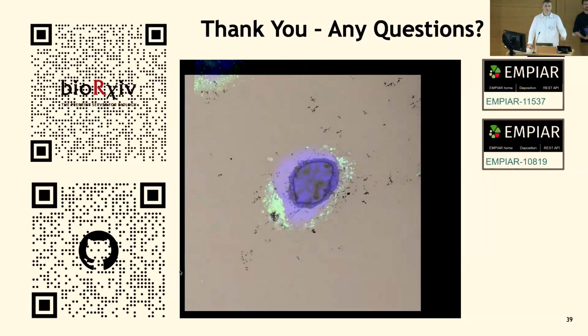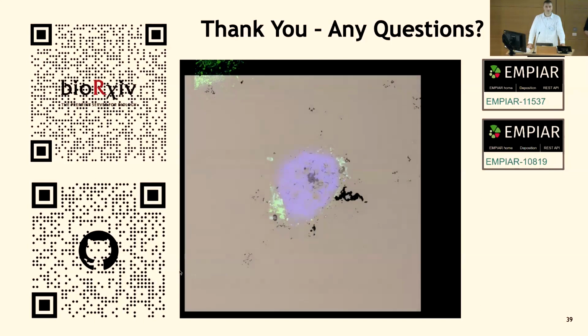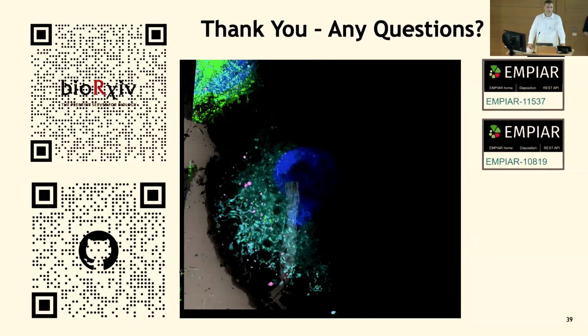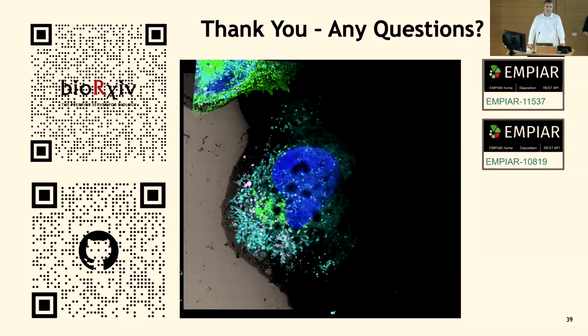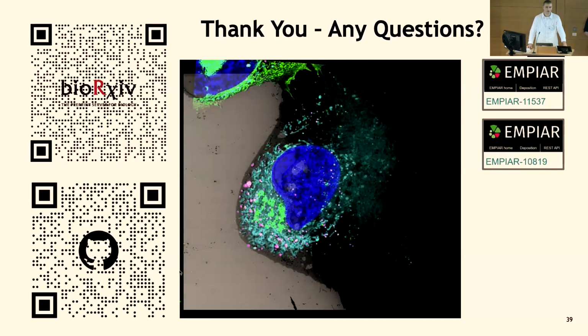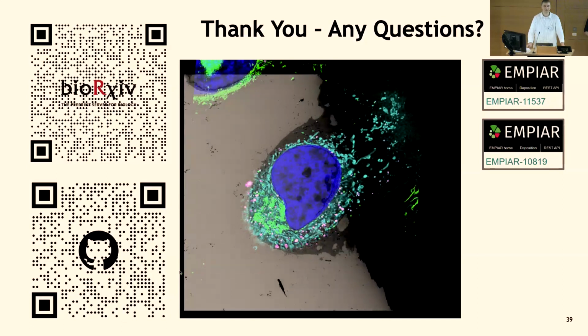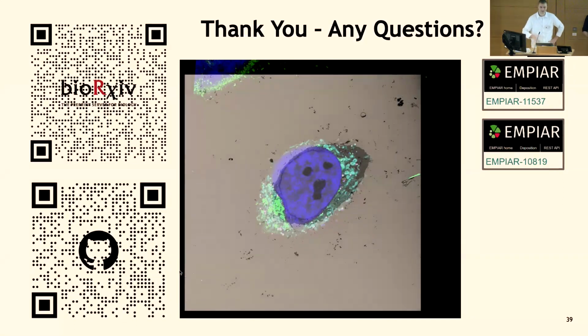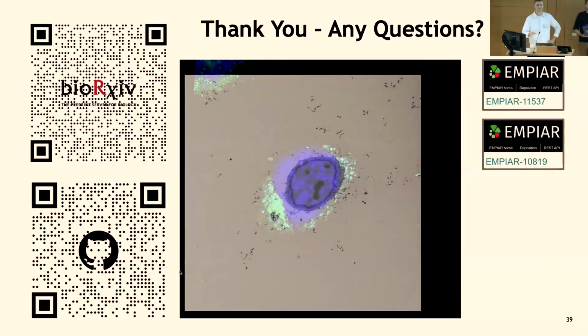I was wondering, what technique of light microscopy is it? Is it confocal or wide field? I think it's confocal. I'm pretty sure it's confocal. As you can see, I'm a computer scientist. My speciality isn't the actual acquisition, more the computation, of course.